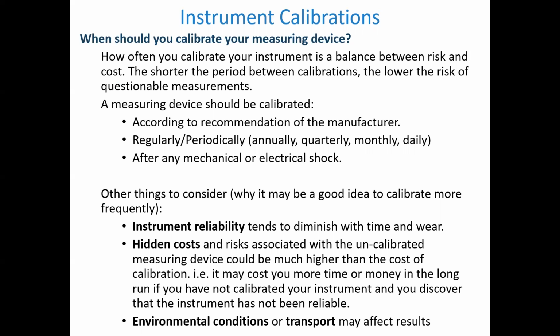Sometimes the manufacturer is recommending more often, or sometimes there's a standard in the lab or for the procedure that says it must be calibrated this many times, and that type of information might actually be recorded. You can see down at the bottom, there are other reasons why you might calibrate. Sometimes as instruments get older, they get more finicky, so it's more important to calibrate them.